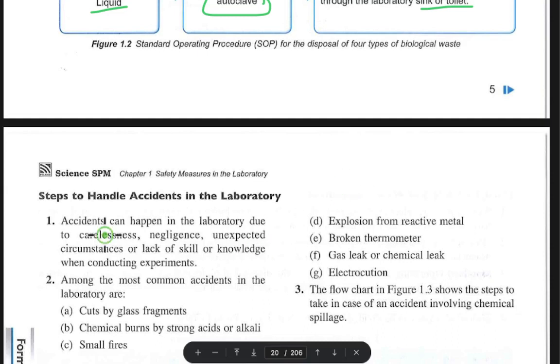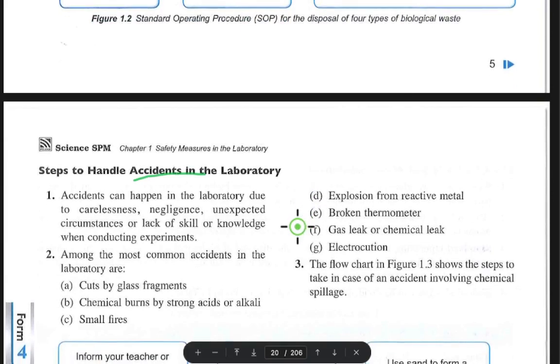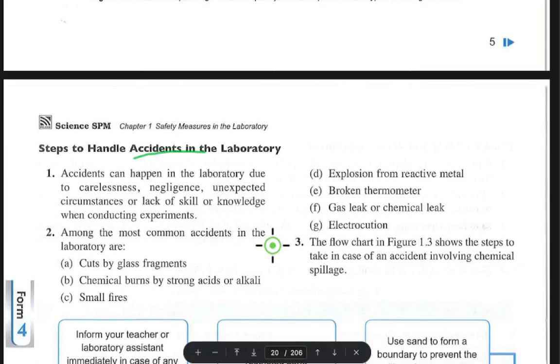Okay, how to handle accidents. What are the common accidents that might happen in the laboratory? I think you guys know this one. I don't know whether you know, but it is very important, like fire, fragments, all these things are very important. Students think, okay, I just study for exams. Actually, you shouldn't just study for exams. You should know this and be very alert about these things. Not just for exams, you might even save a life.